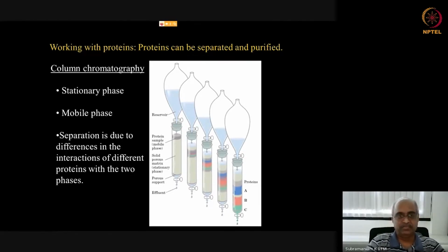Proteins are really important because they are important for pretty much all biological activities, because they are biocatalysts. Every biochemical reaction is dependent on enzymes, and therefore a whole lot of biology experiments actually deal with proteins. So we will learn the theoretical part of a few protein based techniques, primarily focusing on protein separation, like separating individual proteins from a mixture of proteins. The first technique we are going to learn is column chromatography.